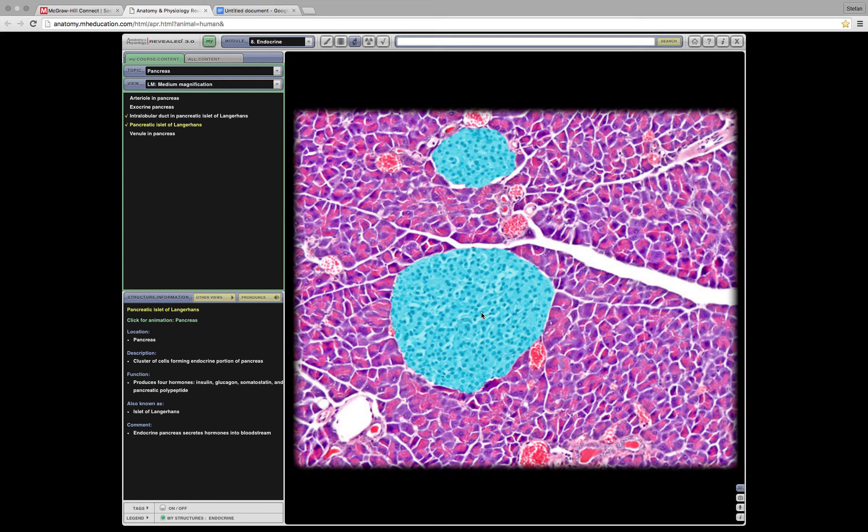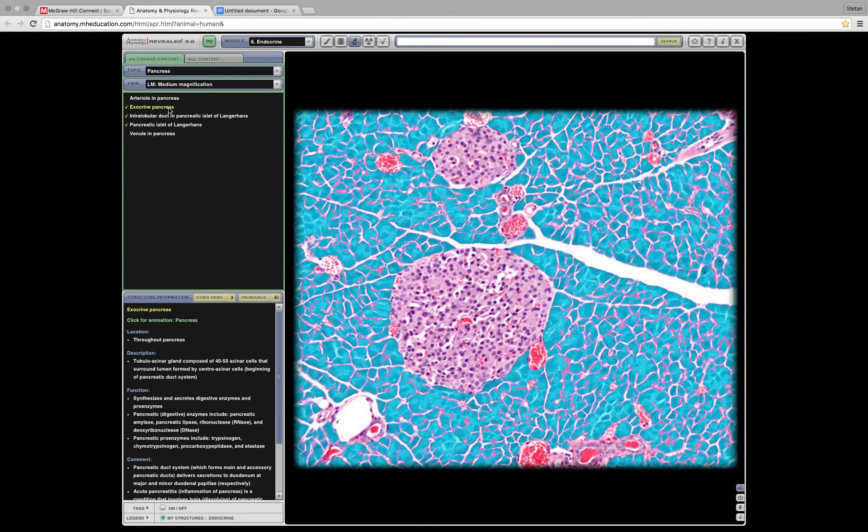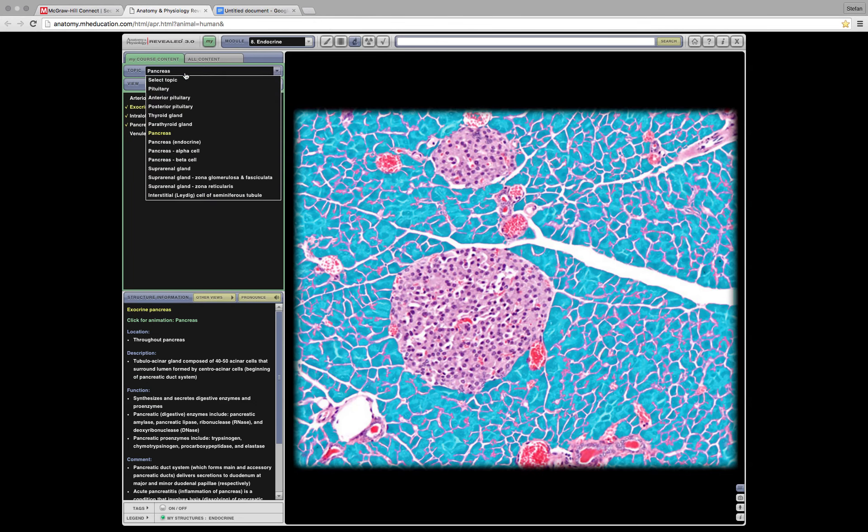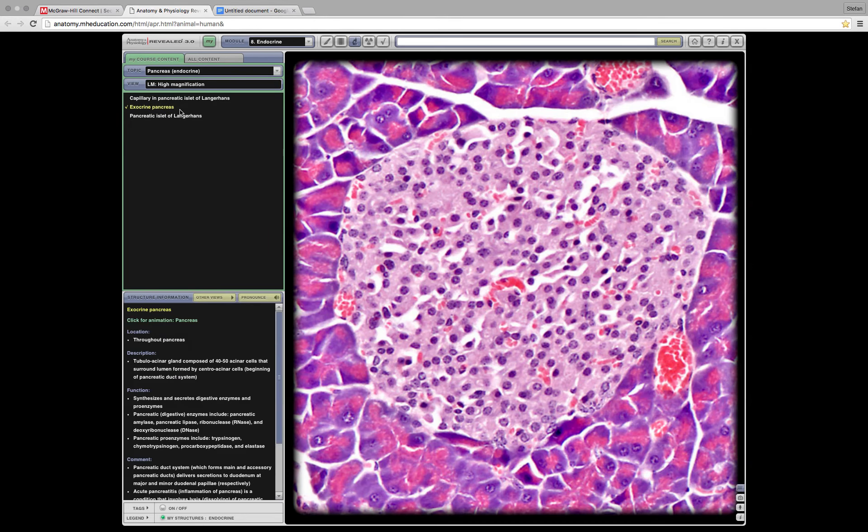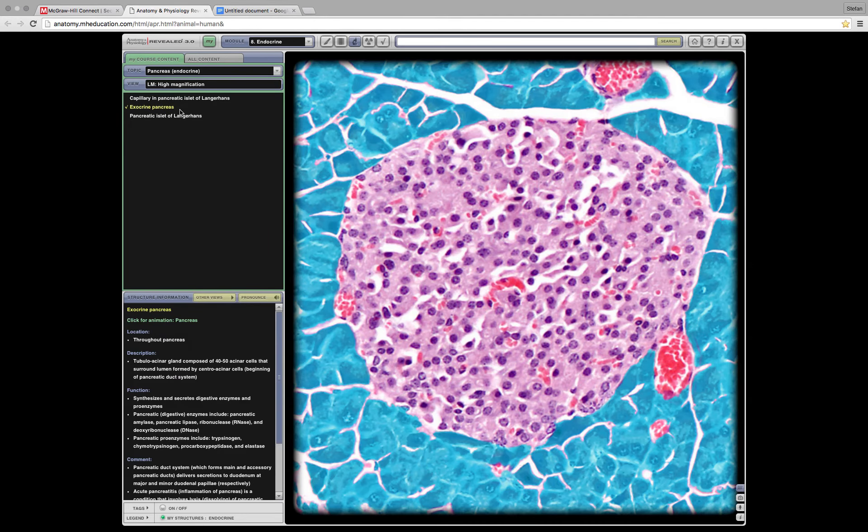And that releases the pancreatic islet. Oh yeah, that releases your glucagon and insulin. And then you have your acinar cells, which I'm not 100% sure they'll even be on the midterm because I crossed it out in my lab book. And if I crossed it out in my lab book, there's a good chance it's not going to be on the exam.